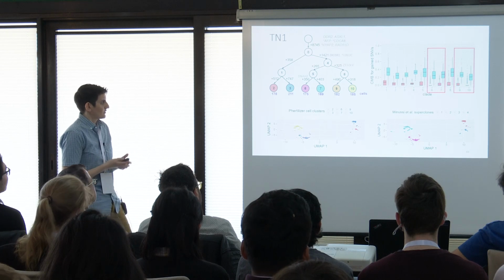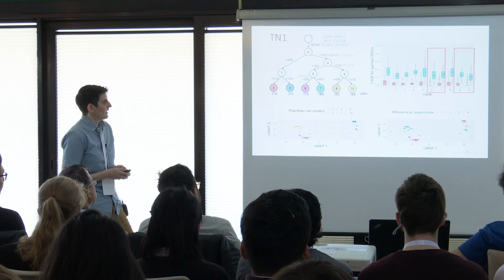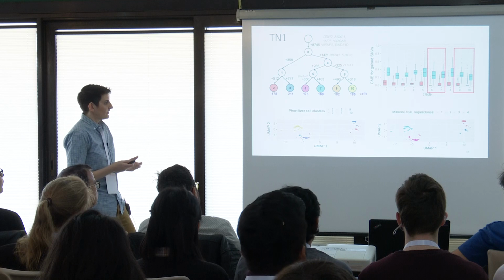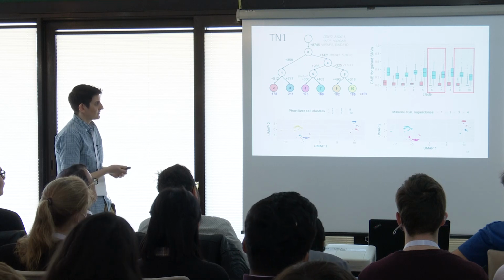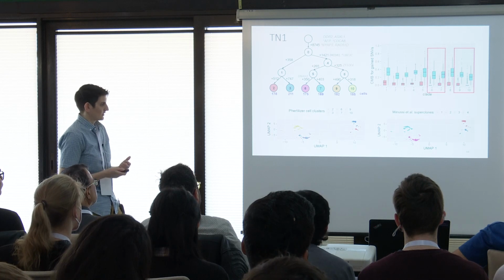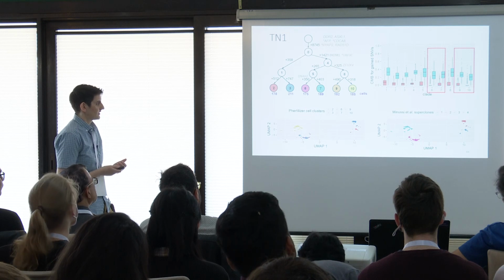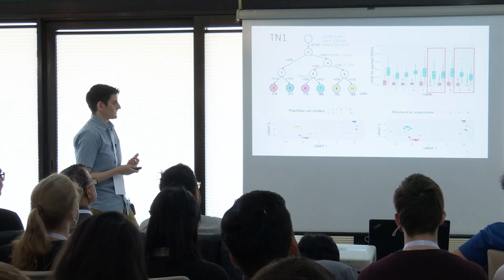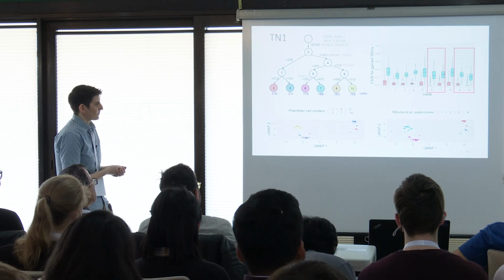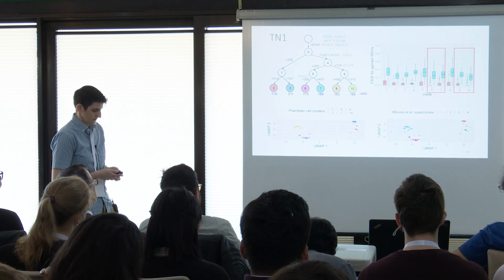Looking at one of these tumors in particular, for TN1, Phertilizer inferred a tree with 6 clones. Again, you can compare the embedding from the original paper, where they used a similar embedding and clustering approach to define a set of superclones, with the Phertilizer cell clusters. Overall, there's good alignment between these cell clusters. However, again, Phertilizer refines some of these copy number clones further, and those are supported by our CMB metric.